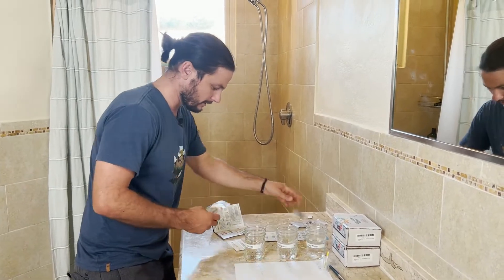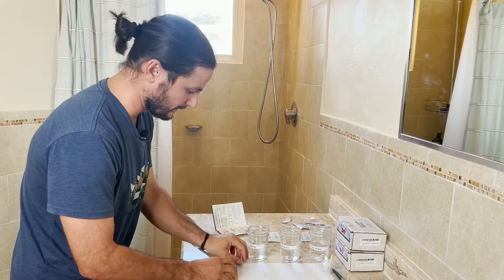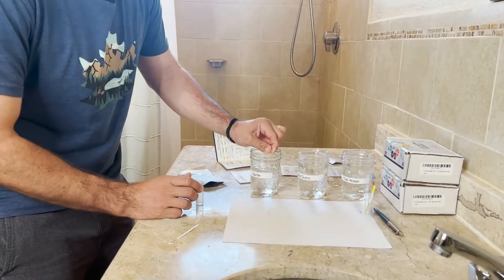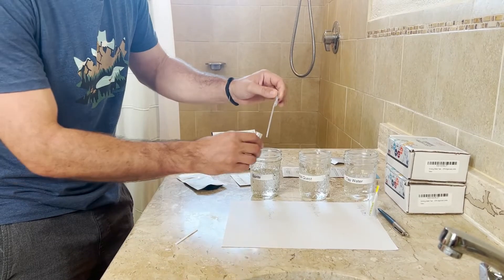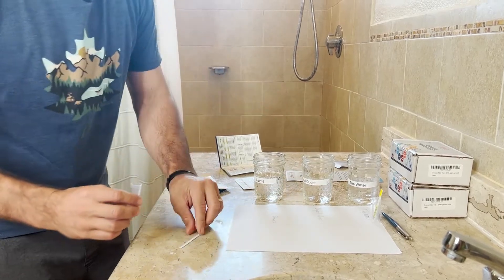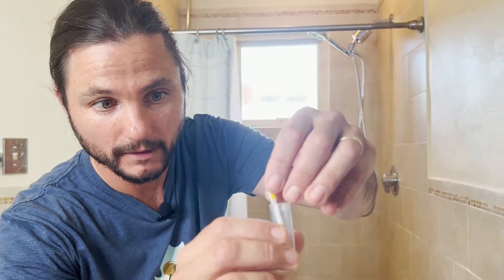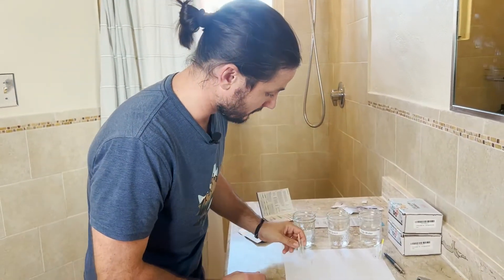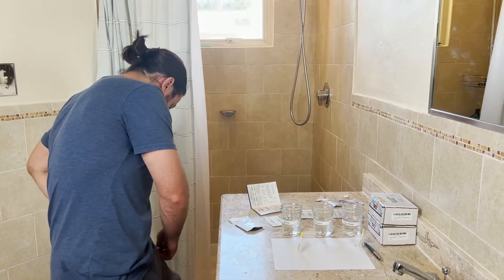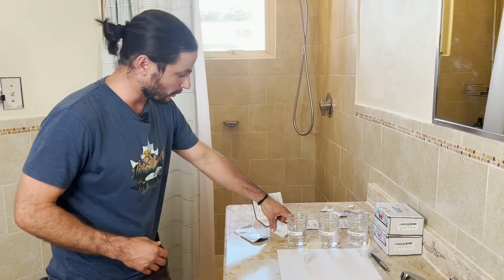Moving ahead, we'll do the Sprite lead test kit. Pull that up, and with the arrows pointing down, put that right in there — and we'll label that one Sprite. Let me check the time. Okay, 10 minutes from now. And then we have the chlorine test.